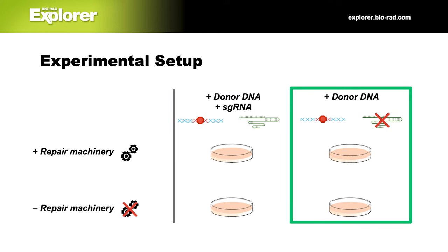Flip the stack over and incubate them upside down. If you have a 37-degree incubator, incubate them for 24 hours. If you don't have a 37-degree incubator, you can leave them at room temperature for 3 days.